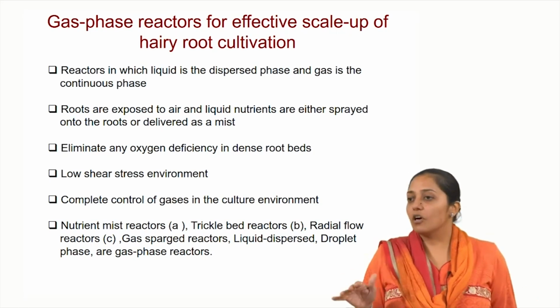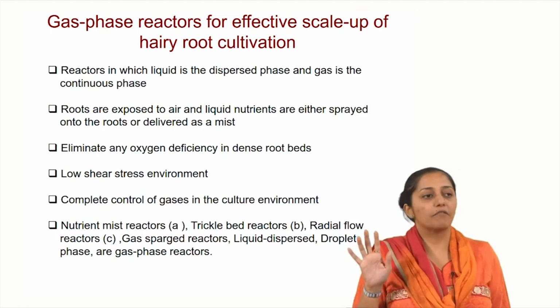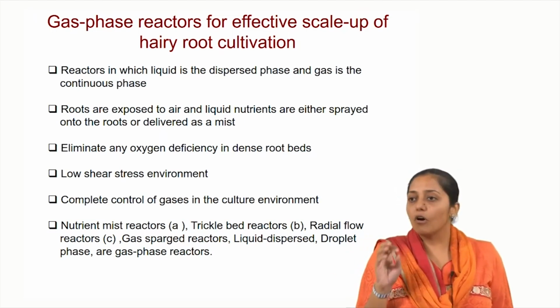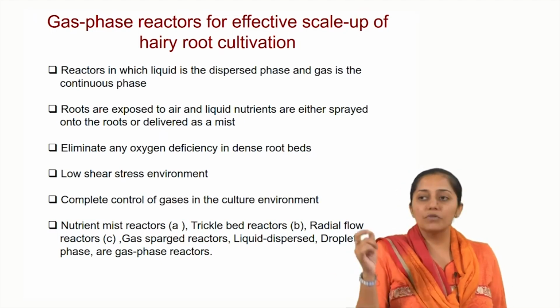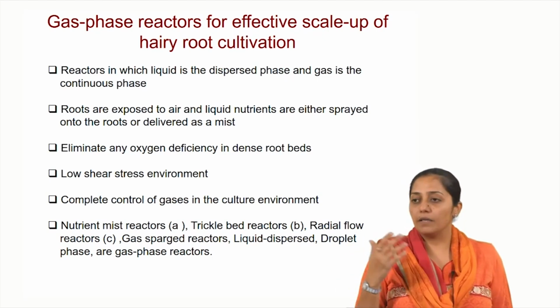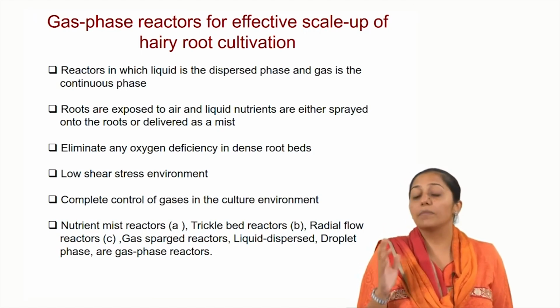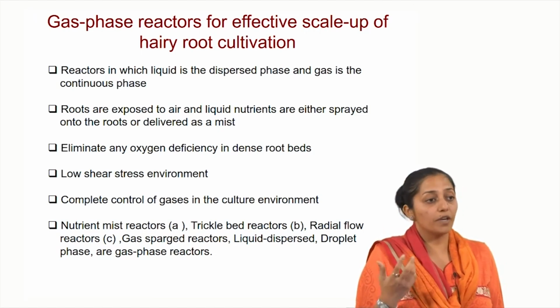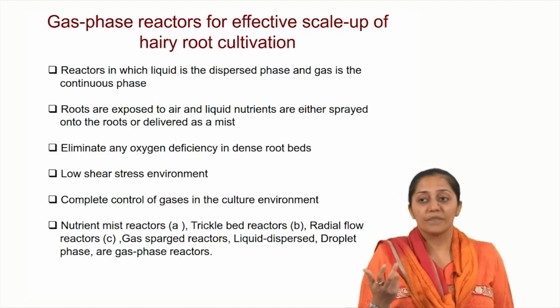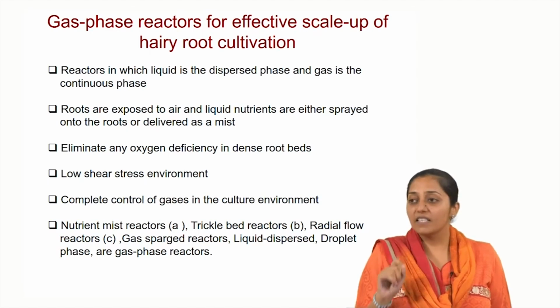Even in the shake flask, we observed a lot of phenolics and mucilage getting collected onto the root surface. Then when we read literature, we found that they are sensitive to hyperhydricity, too much water retention onto the roots. So, how to avoid that was by using mist.